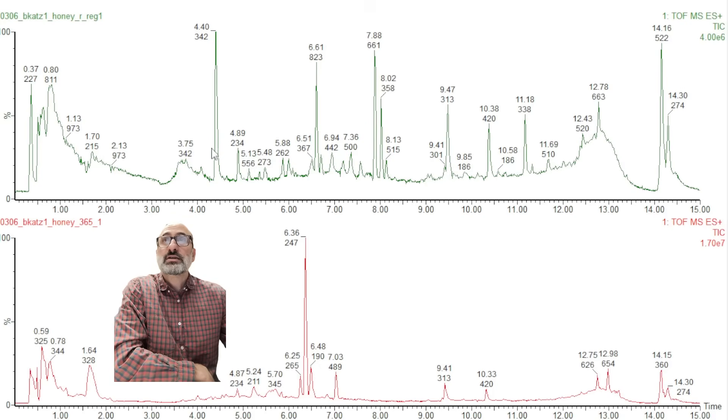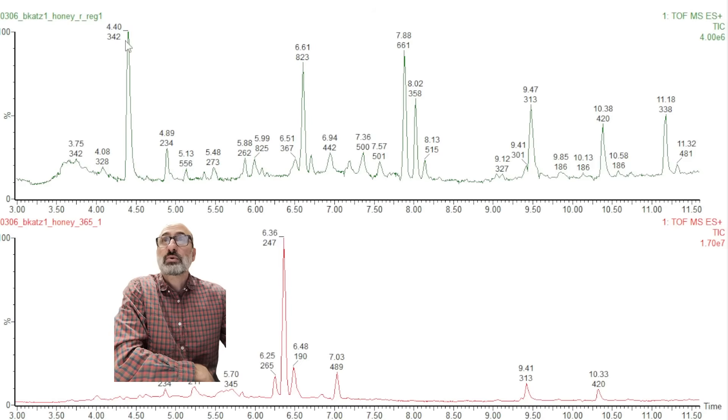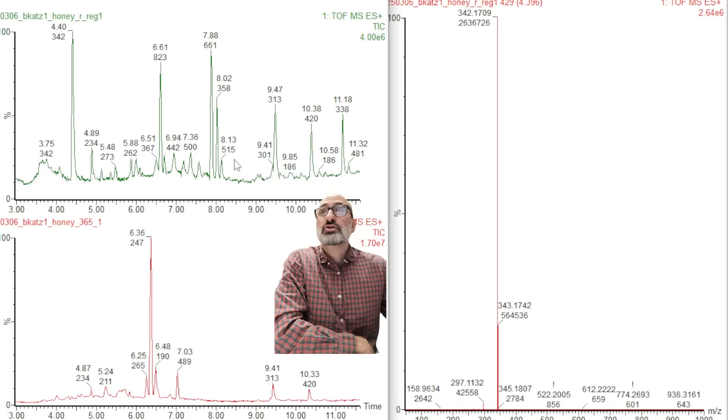But the biggest one I'm interested in is 342, the most intense peak. It's coming off in my analytical region here. So if we zoom in and look at this, we have, yeah, we got the 342 mass. That is definitely only in the royal honey.